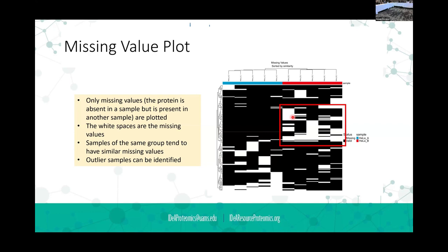I ran into this with a clinical researcher who didn't accept that as an answer. We were working with multiple myeloma and these patient-derived samples that we were isolating based on the presence of CD138. CD138, another name for it is syndecan. It's a protein that's expressed on multiple myeloma cells, and so we had an antibody-based method. So the protein had to be there in order for us to select it.